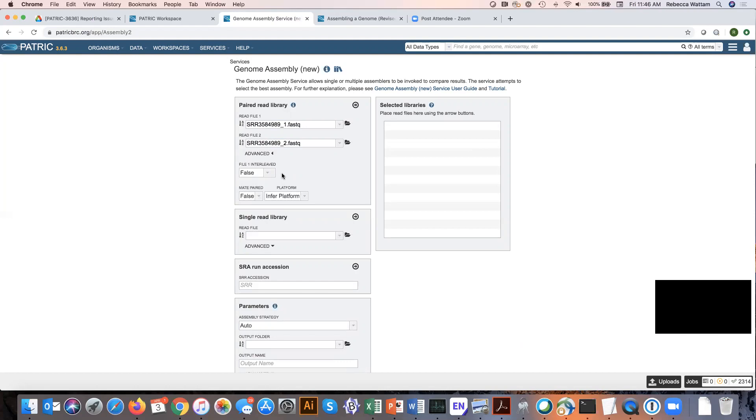This actually doesn't happen very often. That's why the default is set for false. But if you do have that, you can click on this down arrow and click for true.